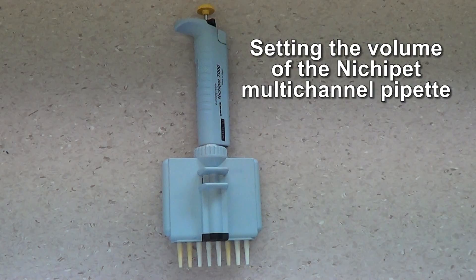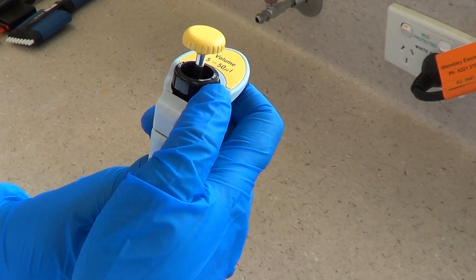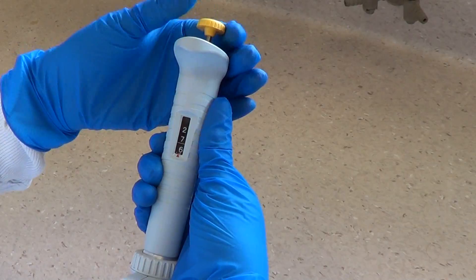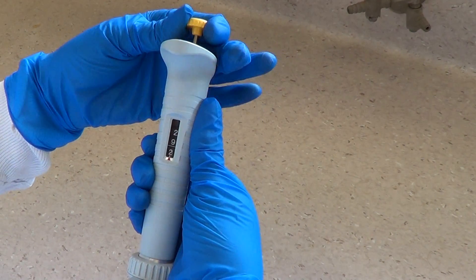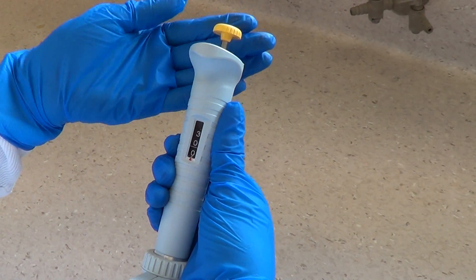Setting the volume of the NichiPet multi-channel pipette. First, unlock the plunger. Adjust the volume by turning the plunger, then lock the plunger.